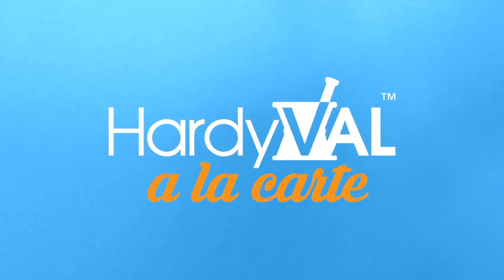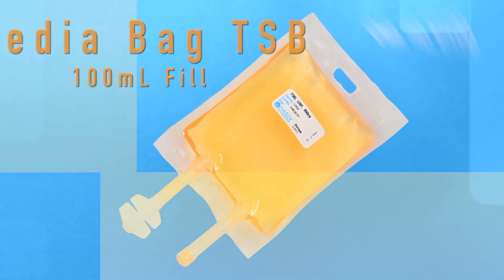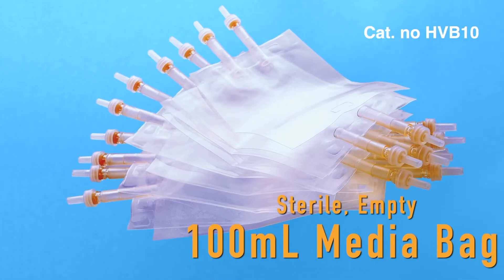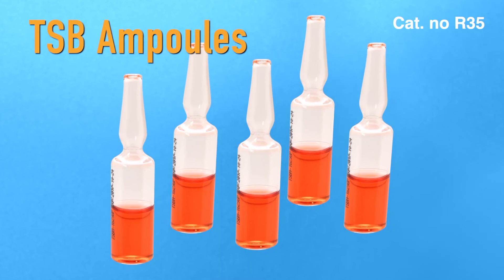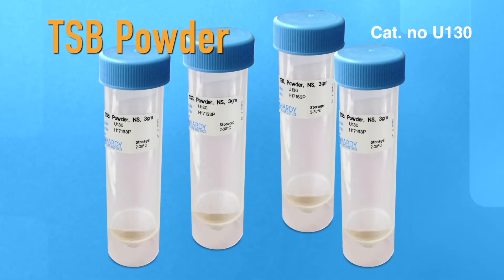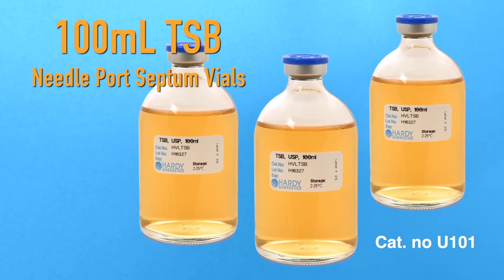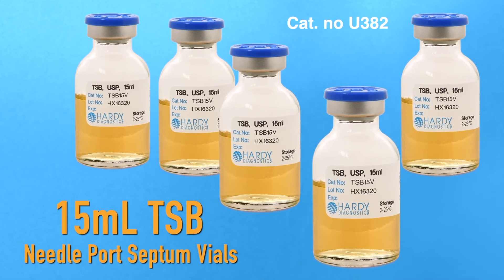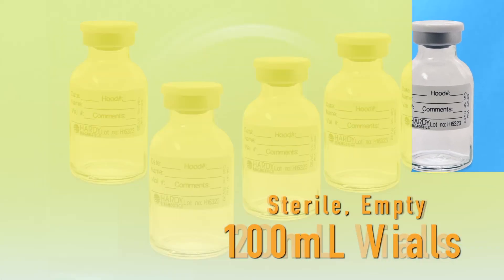Hardival a la carte products include: media bag tryptic soy broth in 100 ml fill or 700 ml fill sterile bags, sterile empty 100 ml media bags, tryptic soy broth ampules, tryptic soy broth powder, tryptic soy broth in 100 ml needle port septum vials, tryptic soy broth in 15 ml needle port septum vials, and tryptic soy broth.